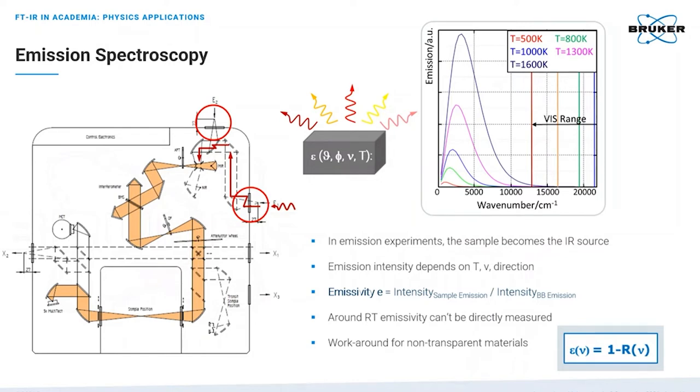As we deal with thermal emission spectroscopy today, I want to step through some basics first here. Thermal radiation originates in the fact that every object with a temperature higher than 0 Kelvin emits thermal radiation. The emitted radiation is highly temperature dependent, which is described by three very important laws: Stefan-Boltzmann's law, Wien's displacement law, and Planck's law, where the third law, Planck's law, is the most important as it includes the others. It delivers a description of the full shape of the spectral radiation density curve.